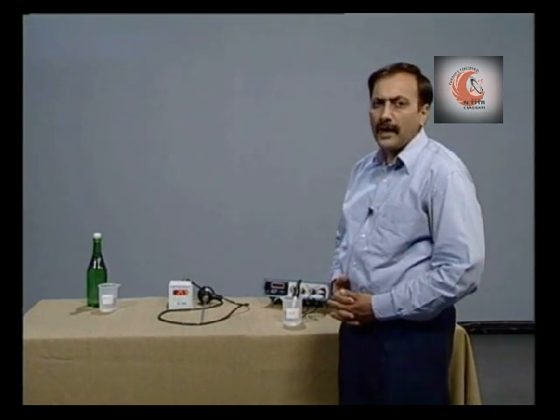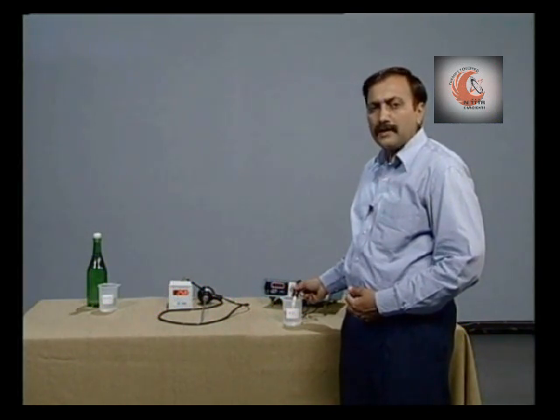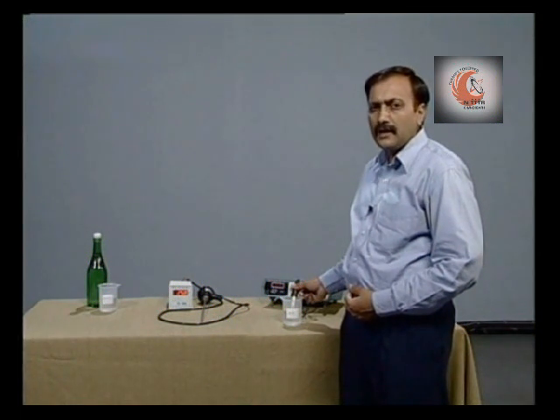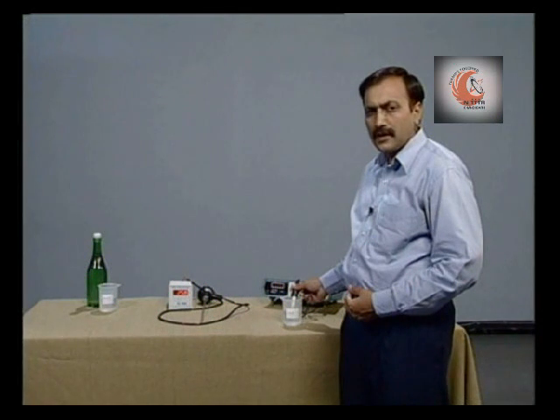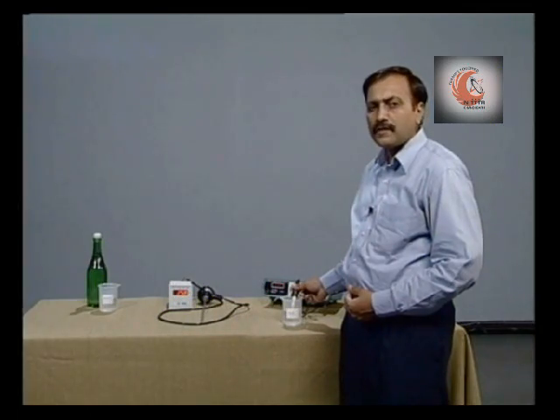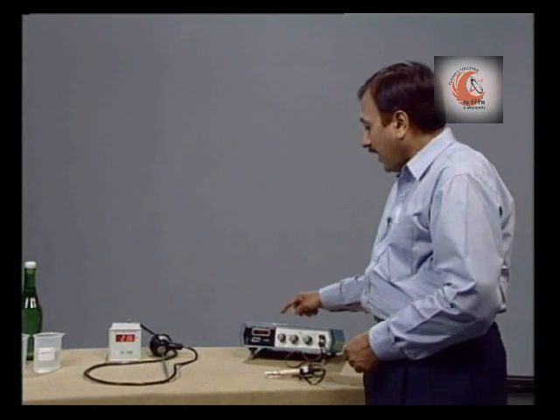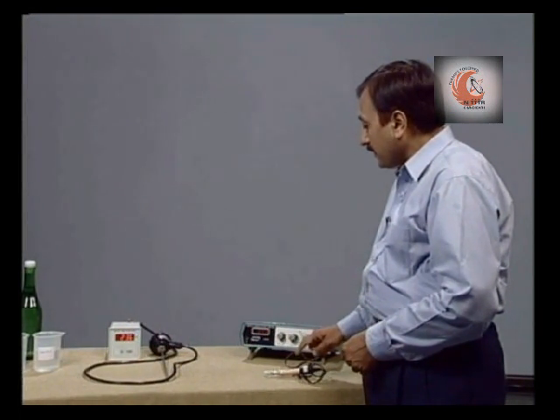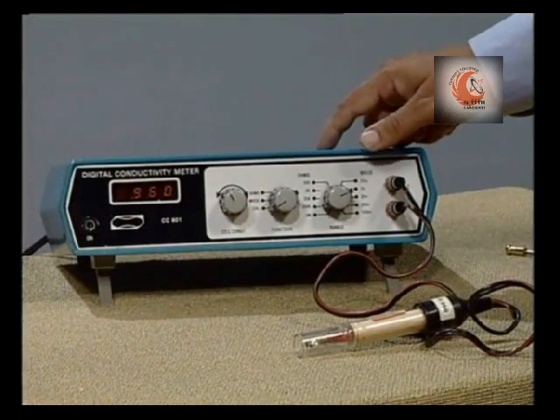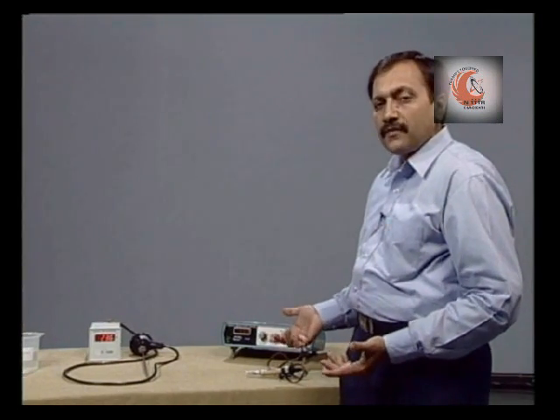Now, in case of any discrepancy, the conductivity cell would require platinization. This is done by following a specific procedure in which the cell is washed with chromic acid first and then placed in platinizing solution for a certain period of time. So, now the instrument is calibrated and the cell is in synchronization with the instrument. Now, we can make the measurement because the instrument is ready for use.